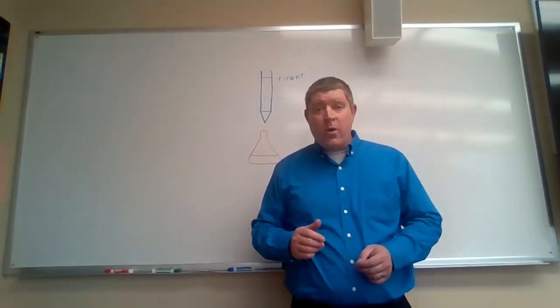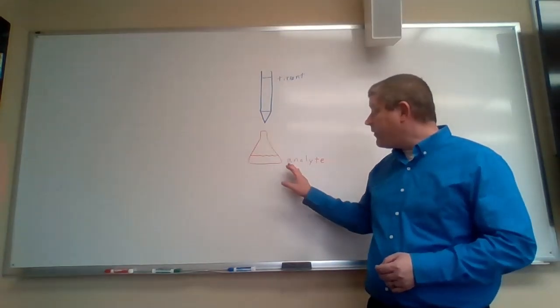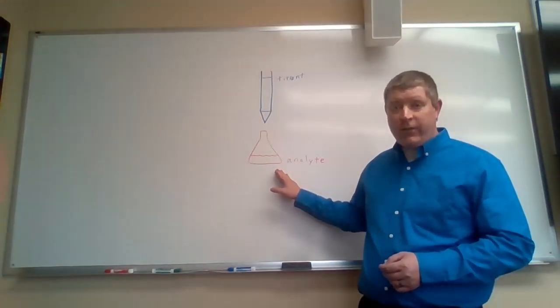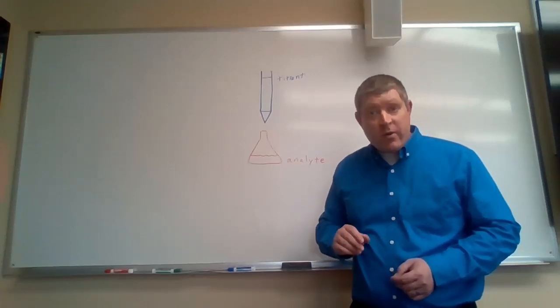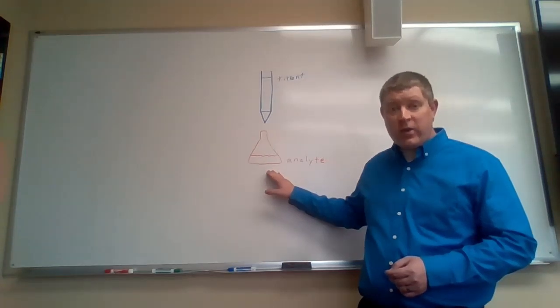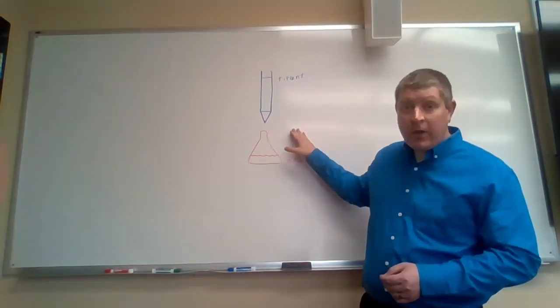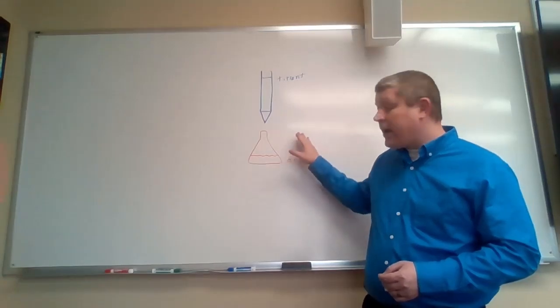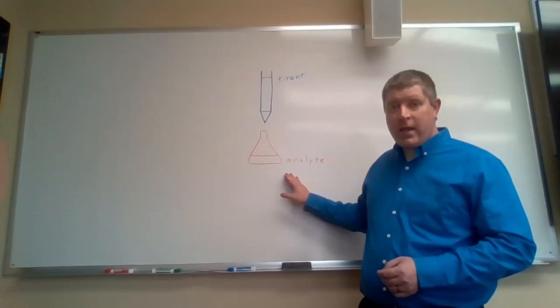In our experiment, we're going to use potassium hydrogen phthalate, which we'll abbreviate as KHP, as the acid, and we're going to put that into the flask. Now, KHP is not hygroscopic, and so we can easily measure the mass of KHP that we put into the water here to determine how much KHP we have, how many moles of KHP we have. Then, we'll add a base, we'll add the sodium hydroxide slowly until we have added exactly equal quantities of the sodium hydroxide and the KHP.